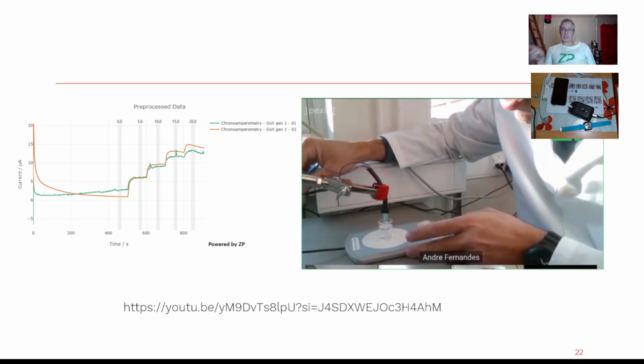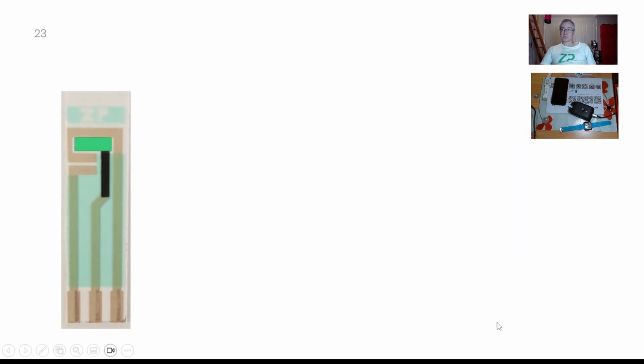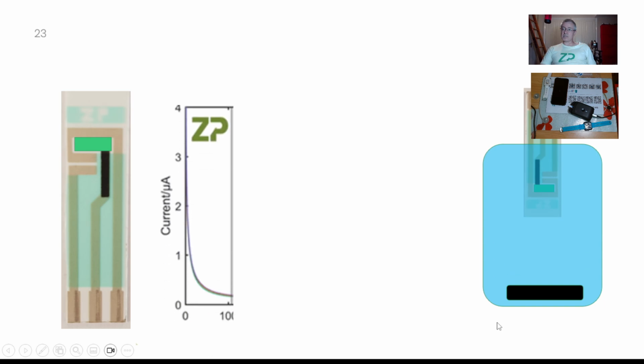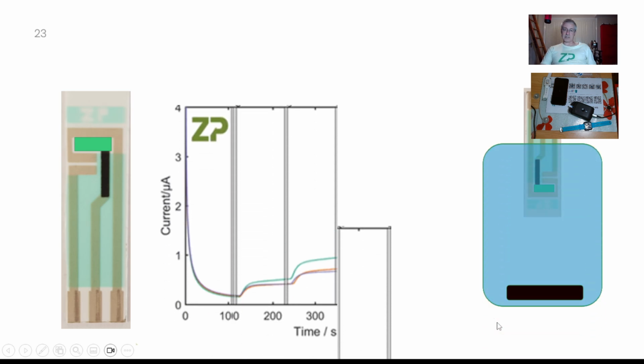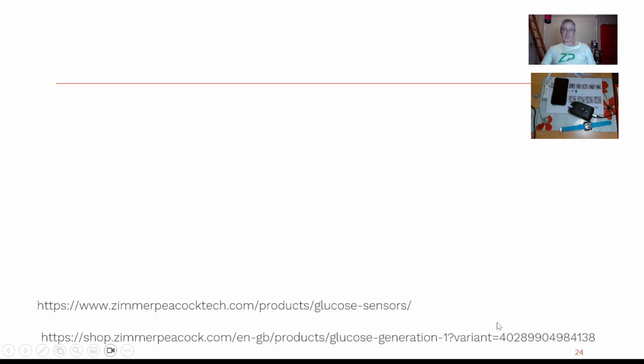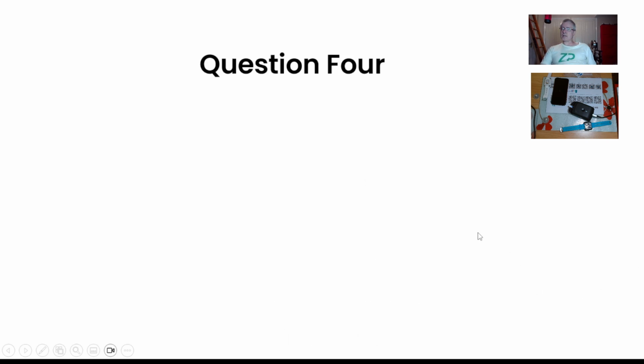You need to be able to repeat Andre's experiment before you actually go back and troubleshoot those experiments, because I've got a suspicion. Now, the way he's done that, obviously he's put the glucose sensor in the beaker and he's adding in glucose periodically, and the signal is stepping up quite nicely. When you've got that figured, then it's time to troubleshoot what you've actually got. I mean, we don't just do this once or twice, we're doing this all the time. So I've got a couple of links that will hopefully help you a little bit.